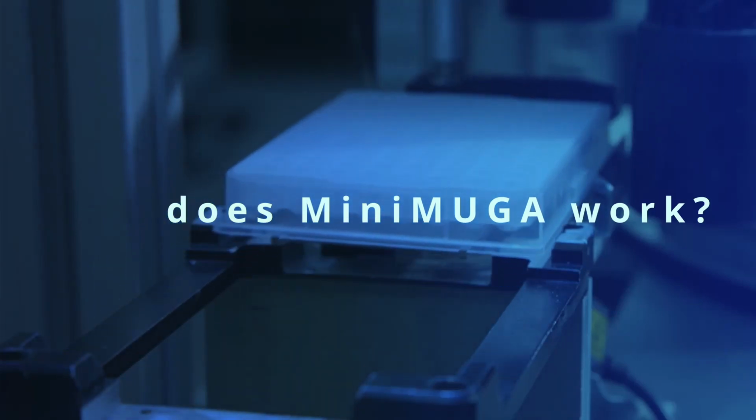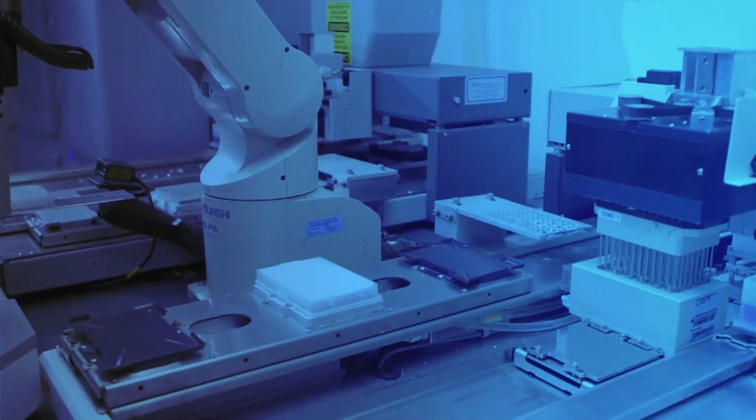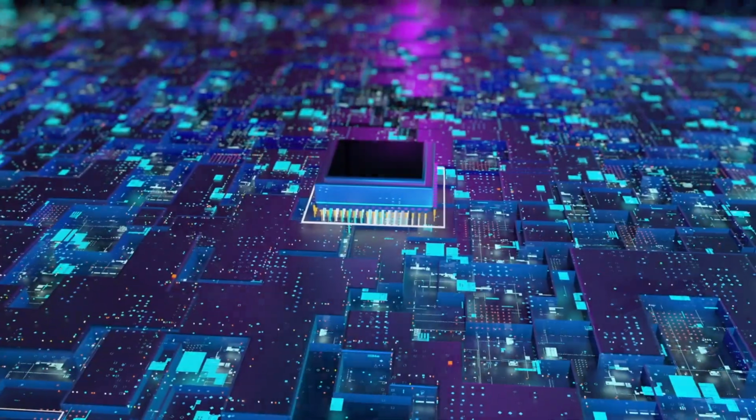First, samples are genotyped with the MiniMUGA array. This UNC-designed array combines almost 10,000 biallelic SNP markers and several hundred intensity-based construct probes.